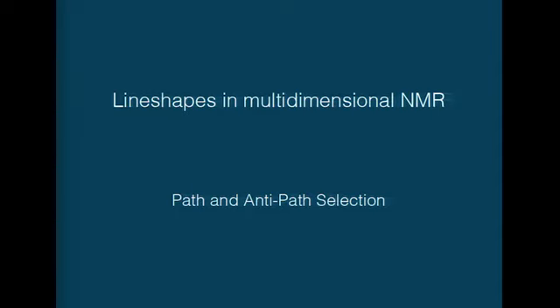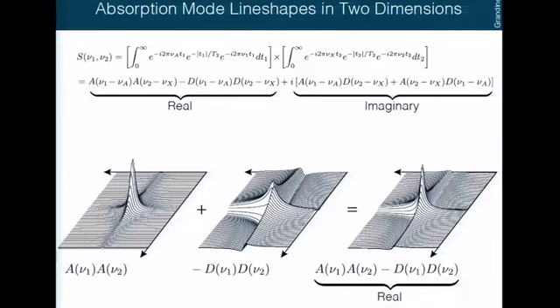Okay, the light's yellow, and I'm going too slow. So let me just tell another case where it's really important to understand this, and that's line shapes in multidimensional NMR. This is another common problem. We have these phase-twist line shapes that we need to get rid of in multidimensional NMR, because they make it harder to resolve peaks that are close to each other. We would rather go to pure absorption mode line shapes. The problem is that when you have multiple dimensions and you do a double Fourier transform, you mix dispersion modes into the real channel.